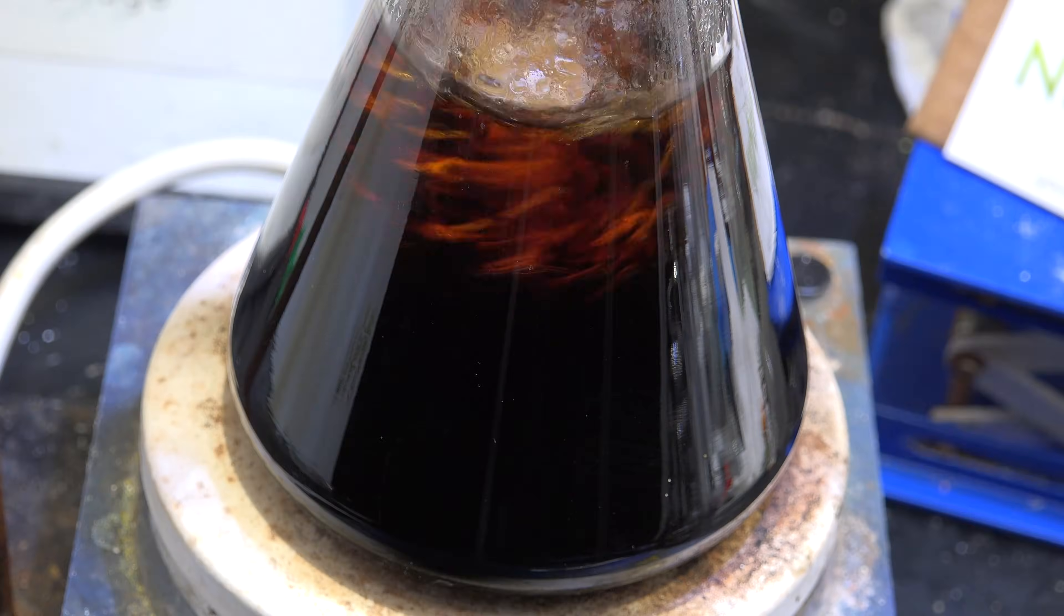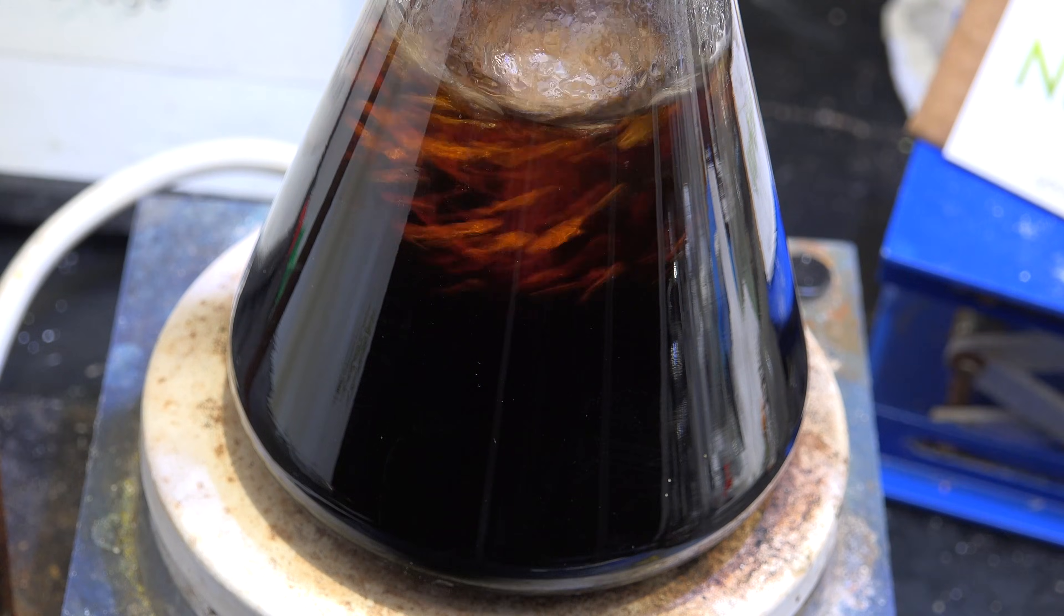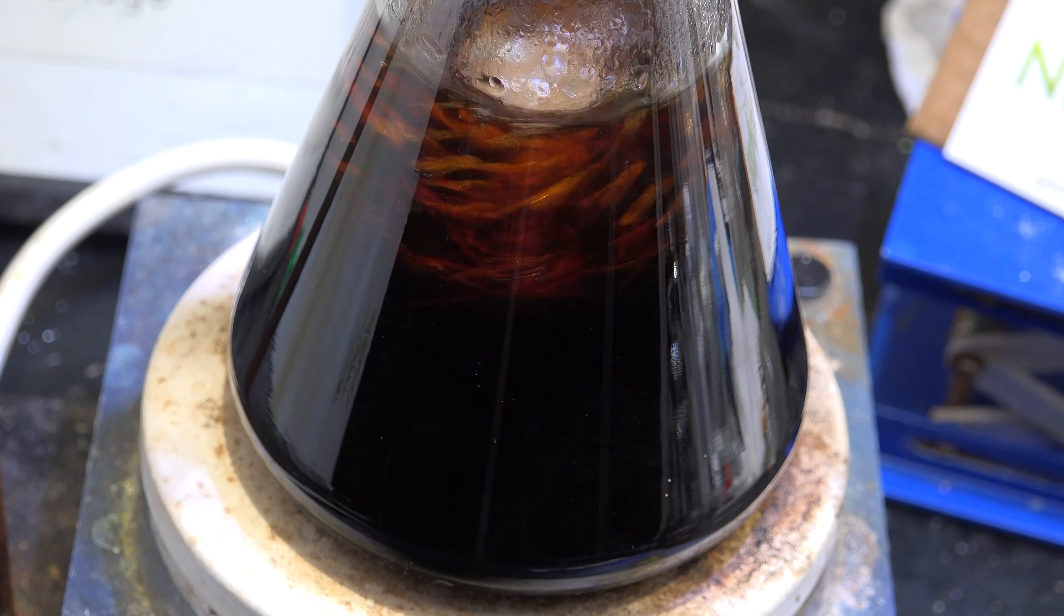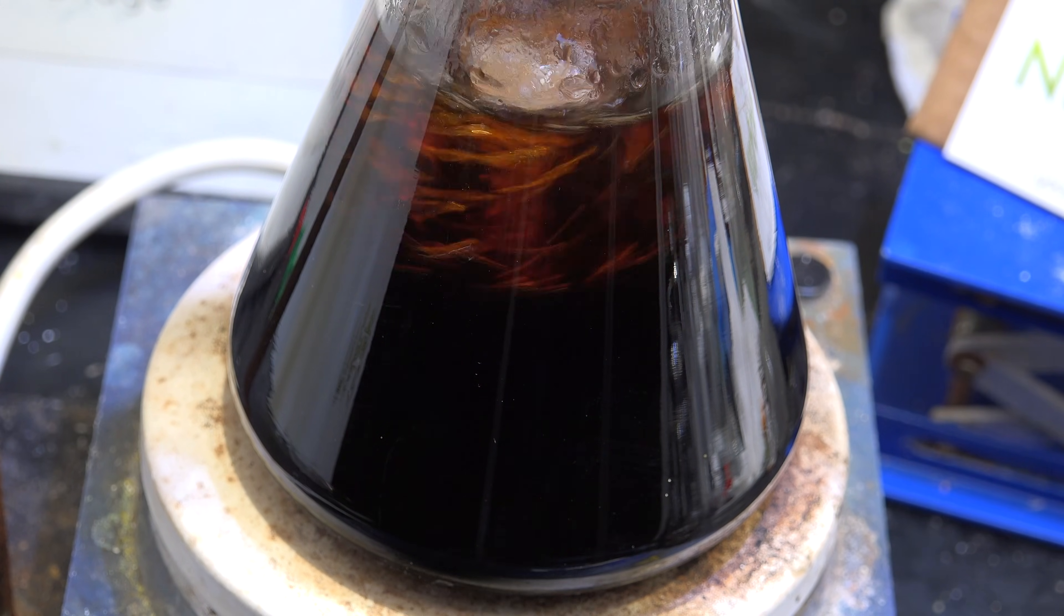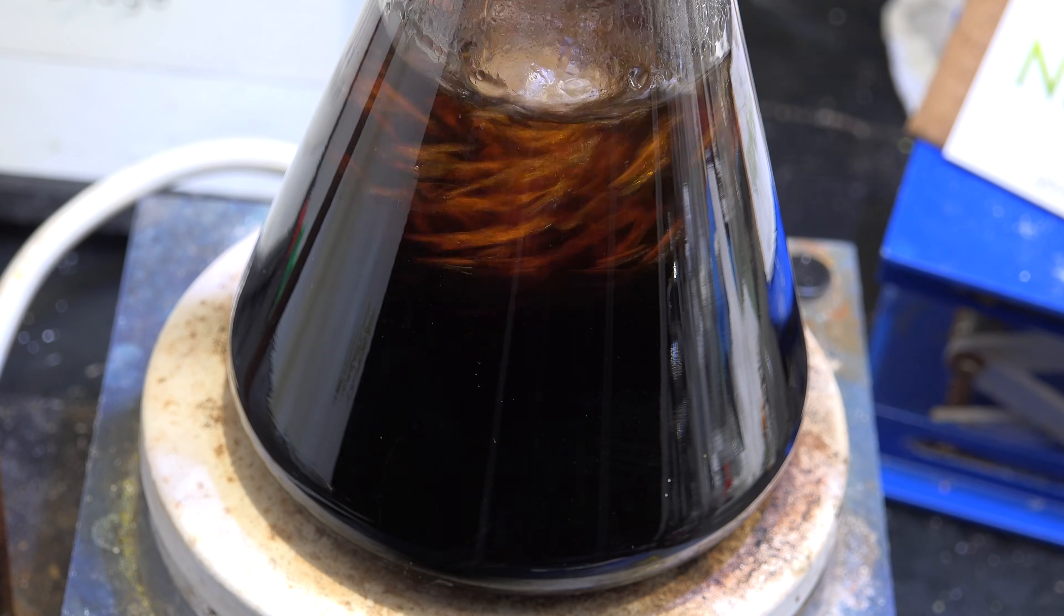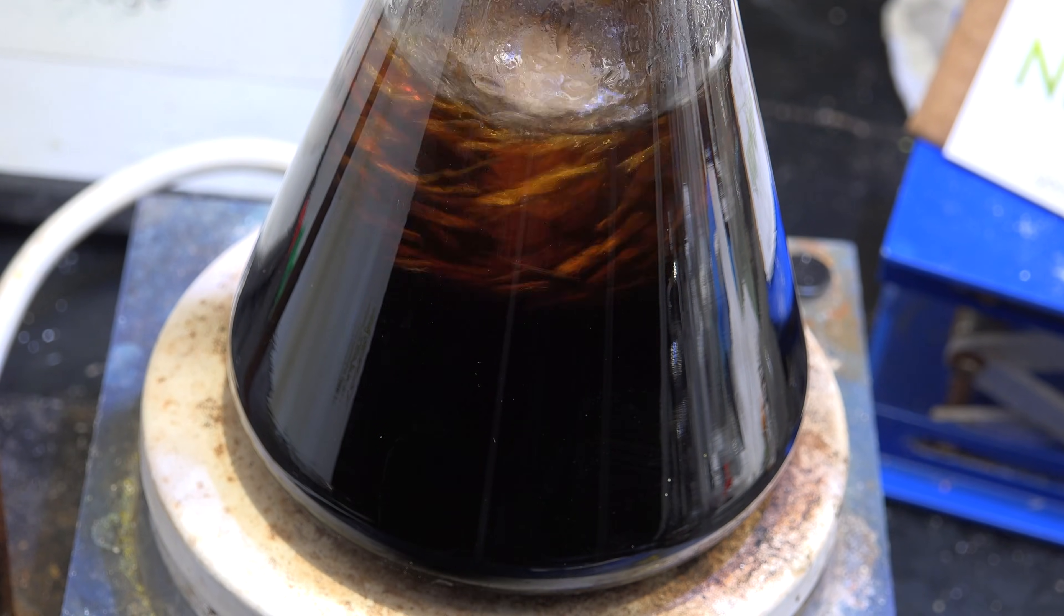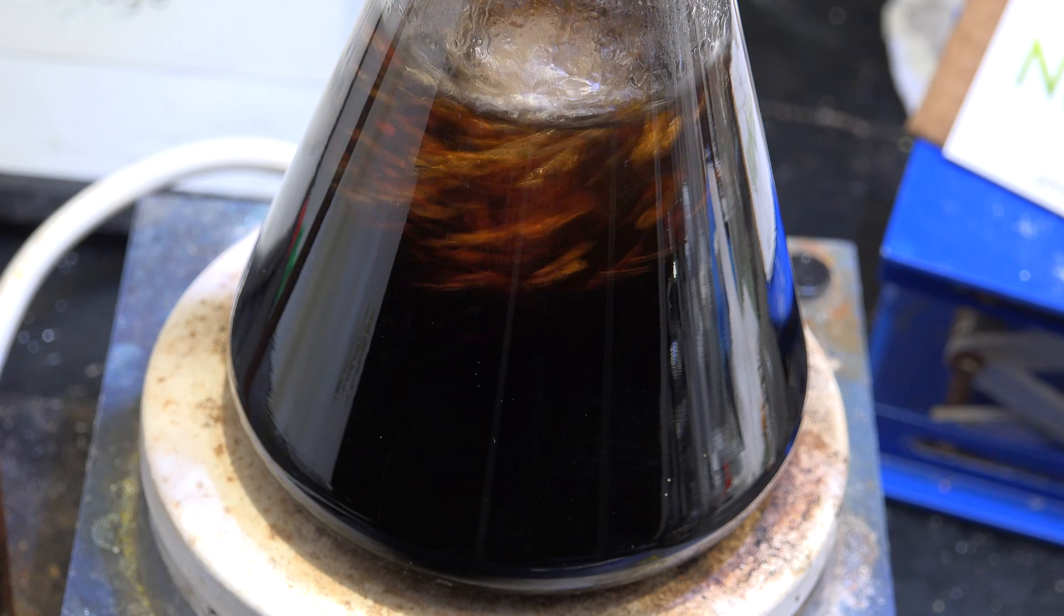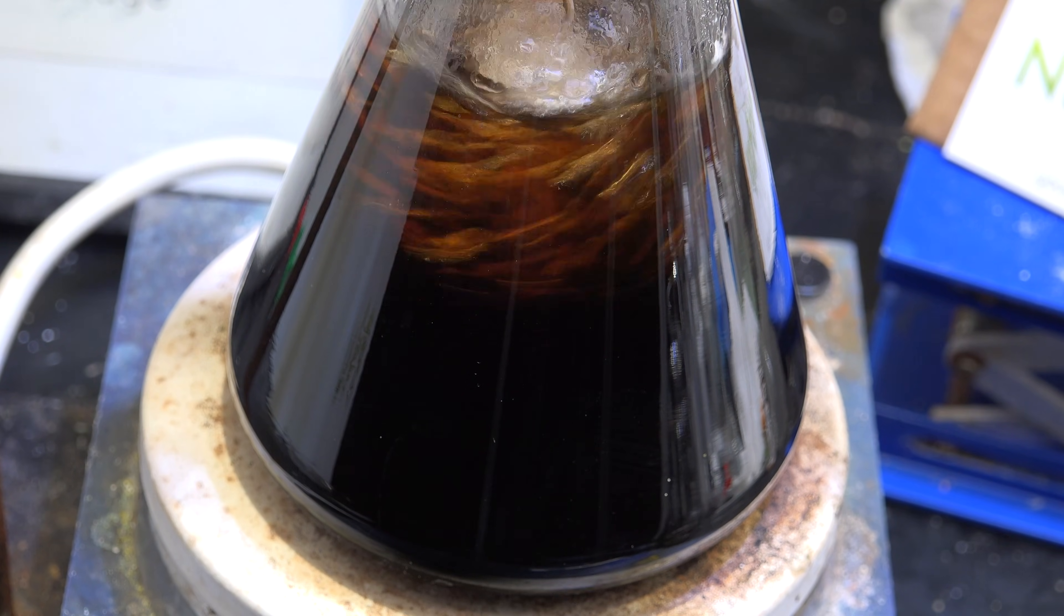In general, using hydrobromic acid seems to be higher yielding than using bromide salts and sulfuric acid. So chemists prefer to use hydrobromic acid based processes if hydrobromic acid is available.